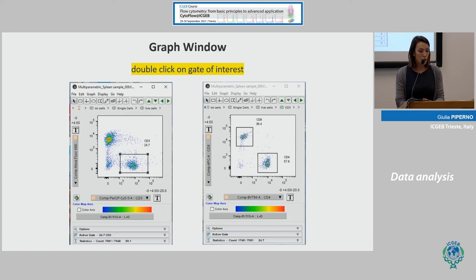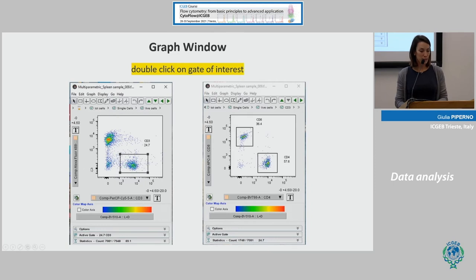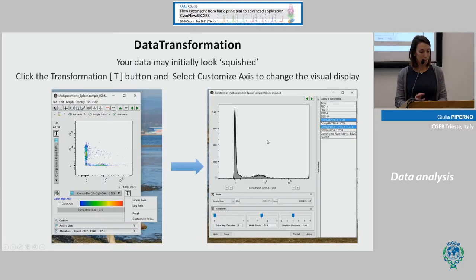Once you identify your population of interest — in this case CD3-positive B220-negative — double-click on it and a new window will open. Here you can change the parameter of interest to identify other populations. Sometimes we need to transform our data because the data can be a little bit squished.